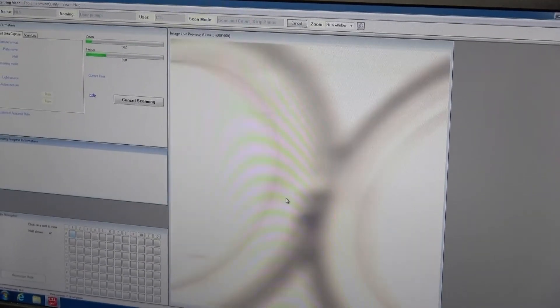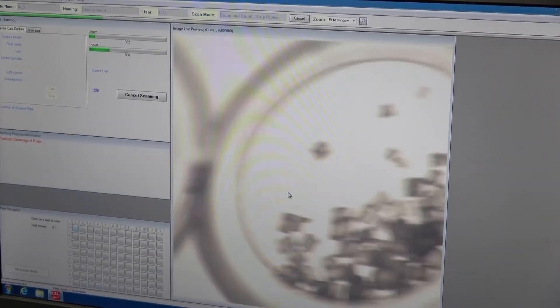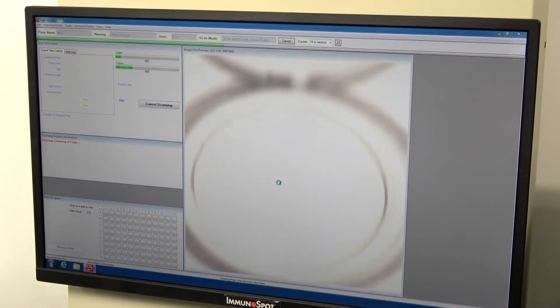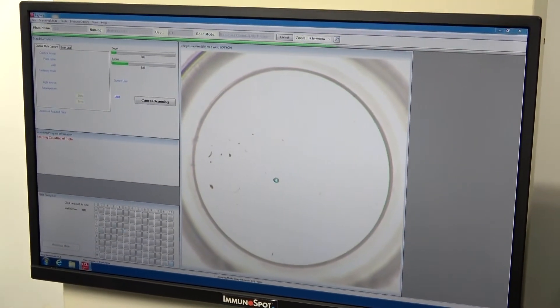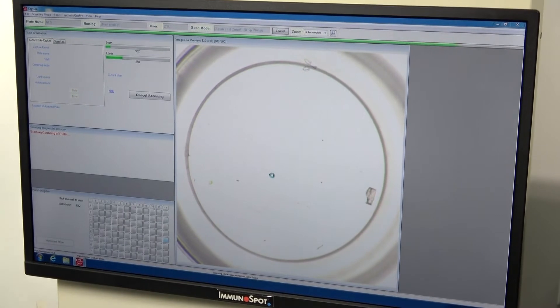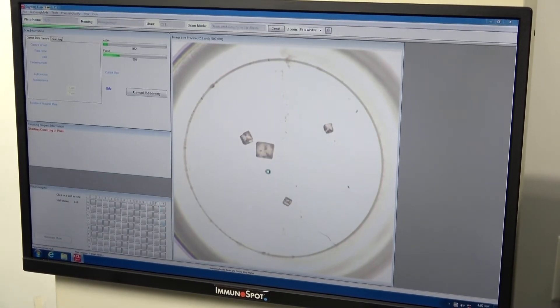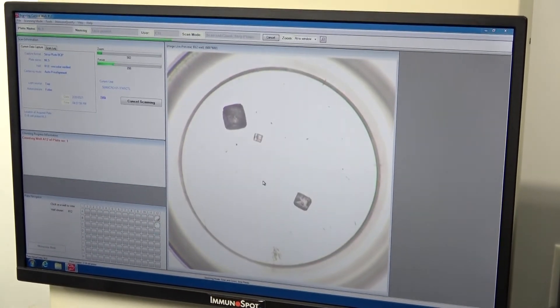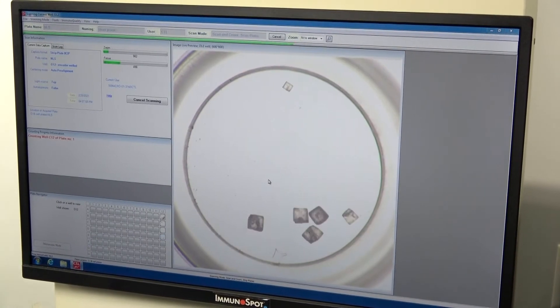The software entirely takes over. We could be doing all 96 wells. We could be doing as many wells as we want or several strips, whatever we need.